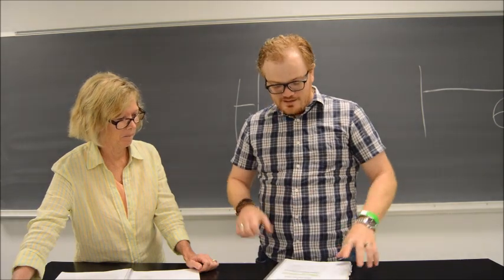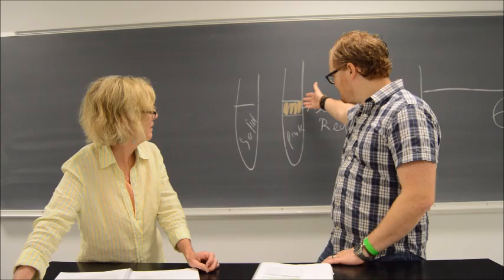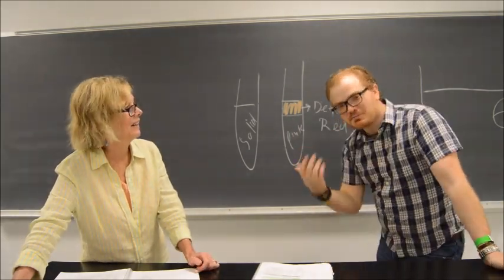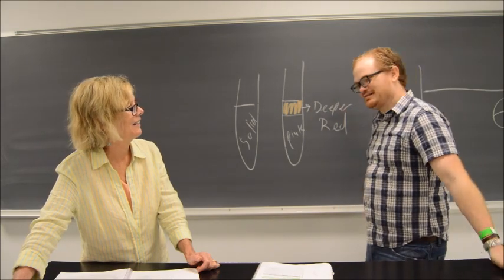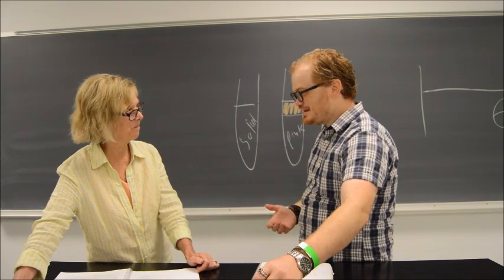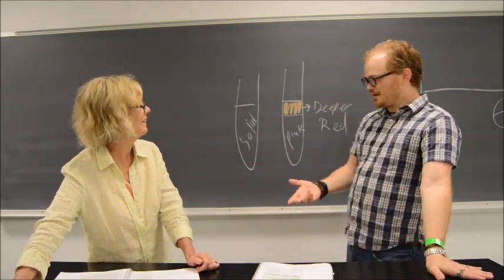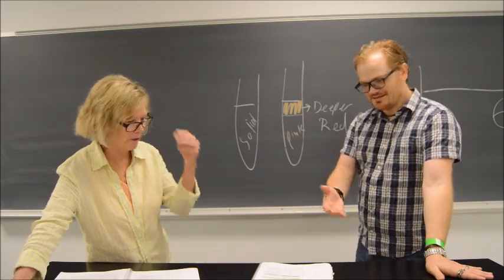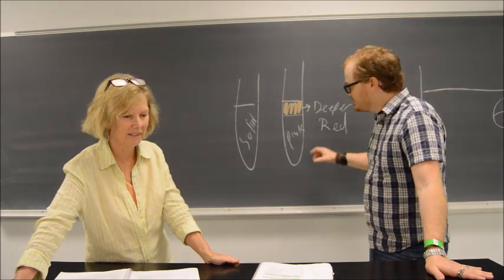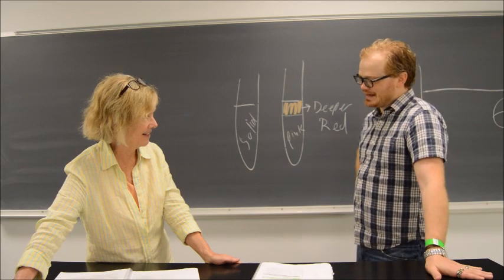Absolutely. You can guarantee we'll throw a test tube up and it's going to have a couple of layers, almost clear on the bottom and red on the top. We're going to say, number one, what test do you think this is dealing with? That would be a lipid test. Part two, what reagent would be utilized to identify this? Sudan IV. And number three, is this a positive or a negative for that test? In this case, it would be positive, and here it would be negative.